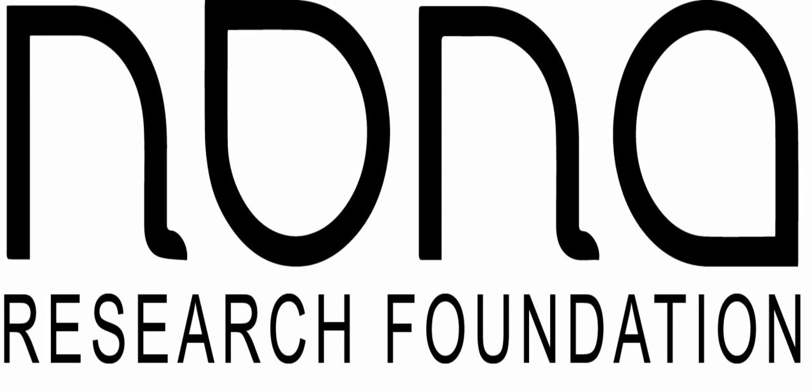It's almost similar to how MedPlum is doing it, but I want to make it so that there's a store for every integration out there. If that integration is, oh, I want to have a Hamilton work on here, or a Tecan, or I want to export this over to Salesforce, or all those little edge cases that everybody's already doing, because I've seen two or three LIMS systems that get integrated into Salesforce, and at the end of the day, usually people hate that integration. So it might be a Salesforce thing, maybe it's just a LIMS thing, that is just not based enough in the lab.